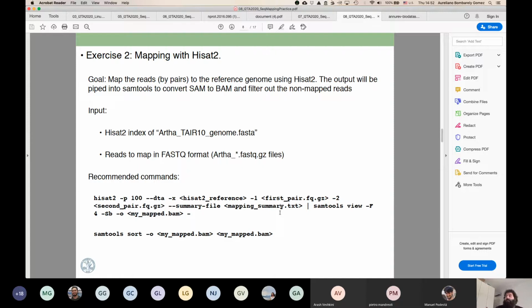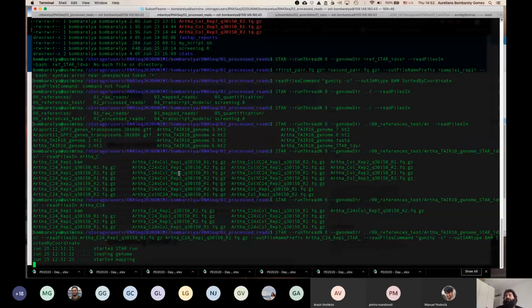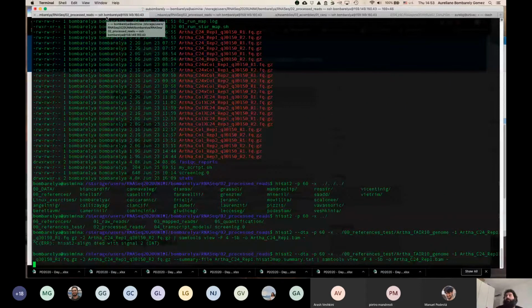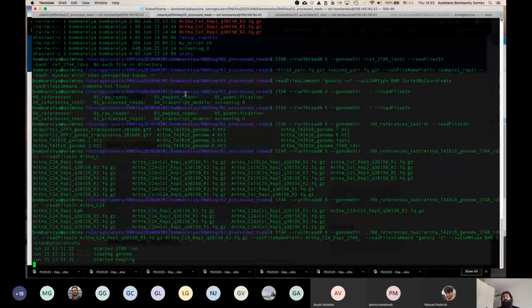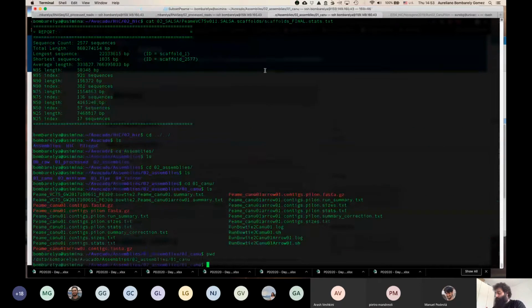Okay. So let me see. This will be running. This is still running. Okay. So meanwhile, we already know what the output is. I already ran this, I have the output. So let me go to the last step, which will be just to run a program to tell us how the output looks.